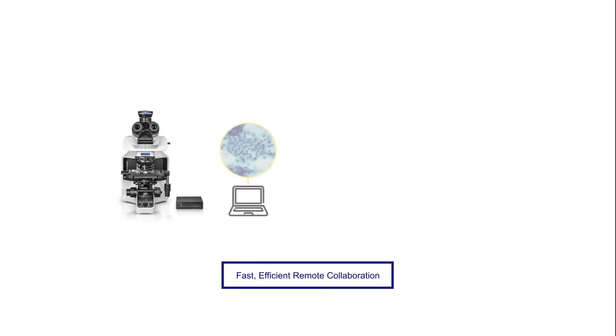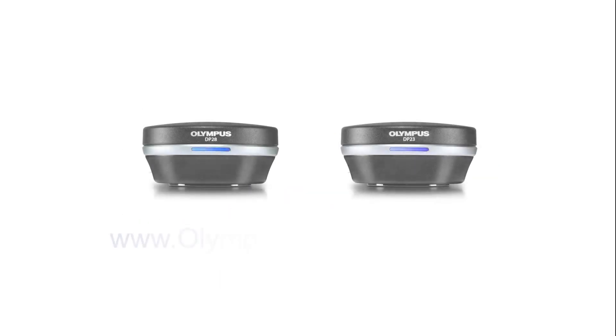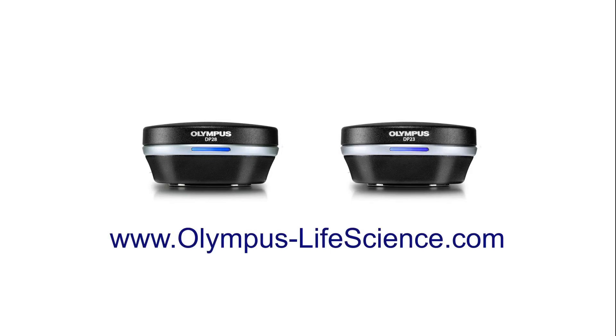For even more versatility, add a dedicated network solution to share and discuss images and results remotely for faster decision making. For more information about the DP28 and DP23 cameras, visit olympus-lifescience.com.